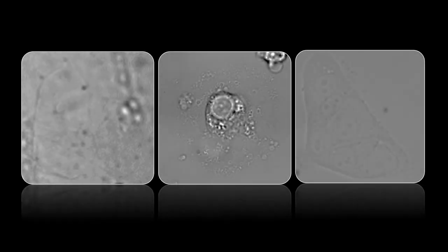In this video, we'll be looking at a new way to enhance the contrast of microscopy images. Microscopy is a powerful tool in the field of biology, but the low contrast often makes it difficult to detect minuscule structures within cells.